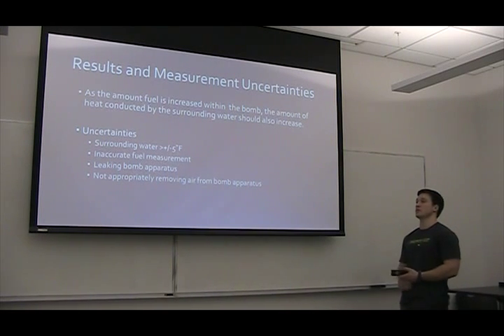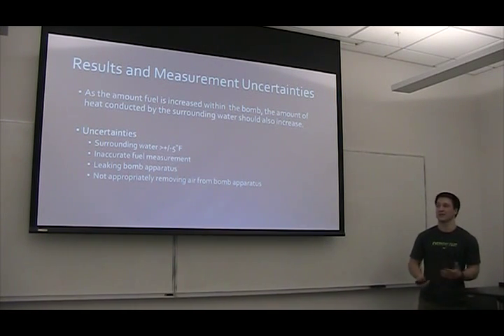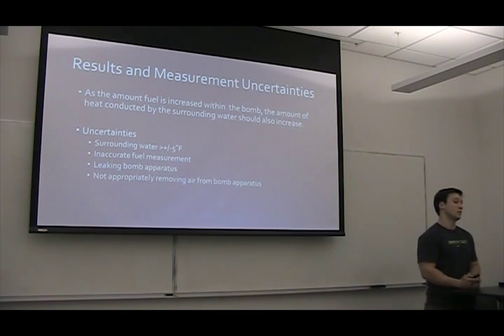A leaking bomb apparatus will mess up your explosion and your numbers, as will not appropriately removing air from your bomb chamber. Any questions?